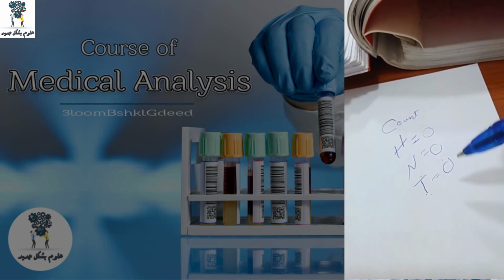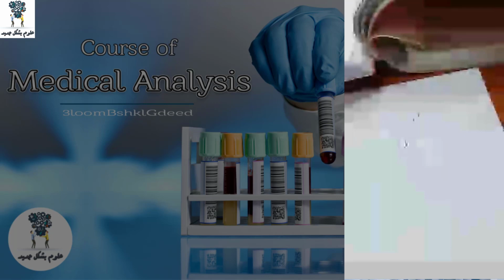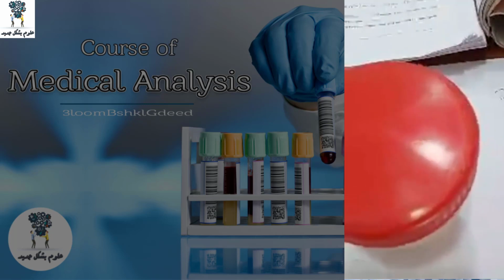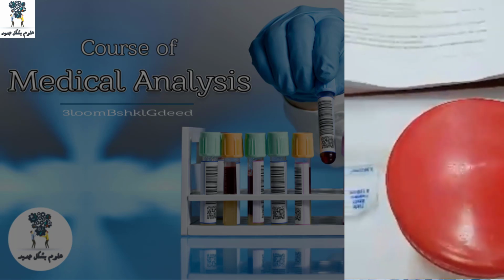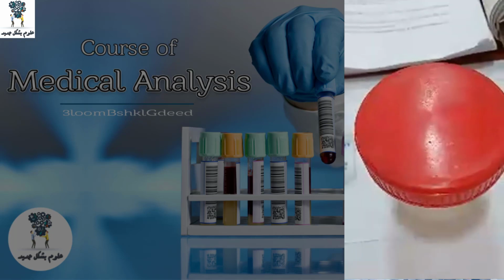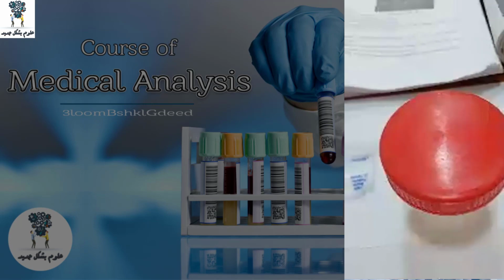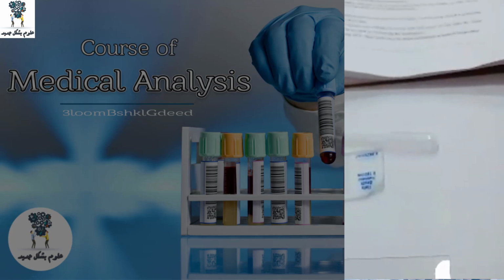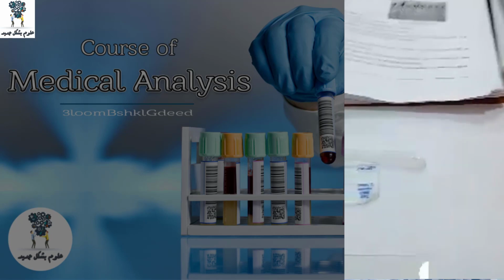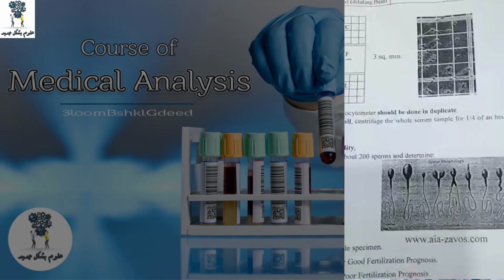So you should identify actually a normal sperm or an abnormal sperm. This test is really very hard, but we should have accuracy in it, because it is not good to write a false result for this test. It's a sensitive test, and according to that there may be an operation. Good luck with me for this count.